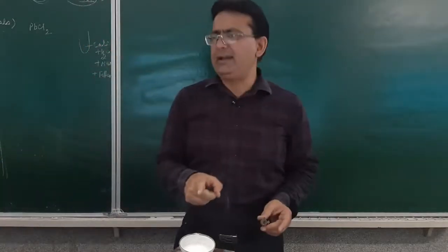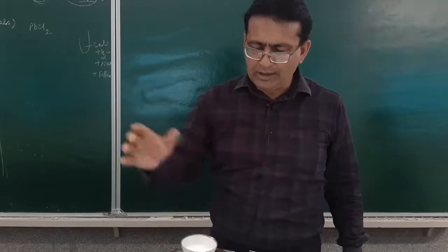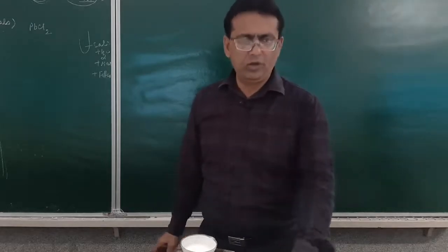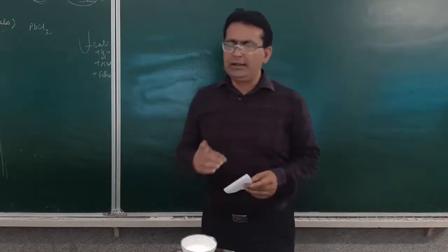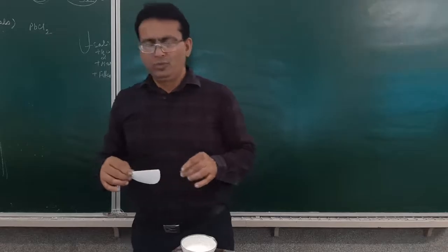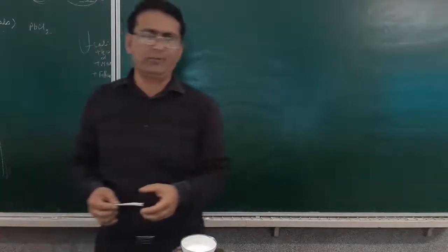Now we will be carrying out the second test to identify the nitrate ion. And for that, we will be using a sodium carbonate extract. How? I have taken the salt into this and then added sodium carbonate into this in 1:3 ratio. I will heat it to boil and then filter. When I filter, residue will be separated out in this case, which will be discarded, and the filtrate will be used for the test of a nitrate. And that filtrate will be called the sodium carbonate extract.